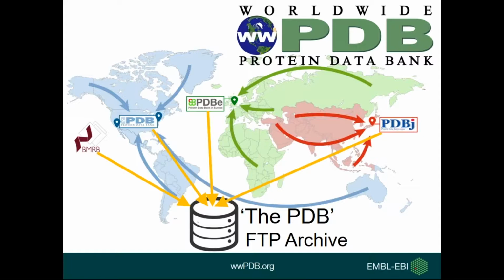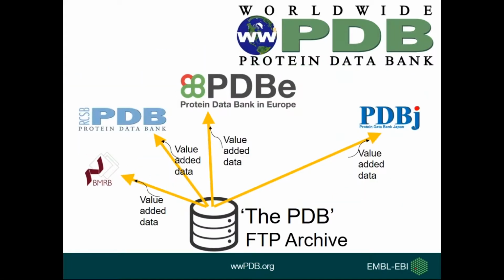And together with our partners in the rest of the world, we work together to put data in the PDB, which is the FTP archive of data files. And then from that archive, we serve that common data out on our respective websites in different ways with different search systems, with lots of value-added information to help you find what you need and use the best data in the easiest possible way.